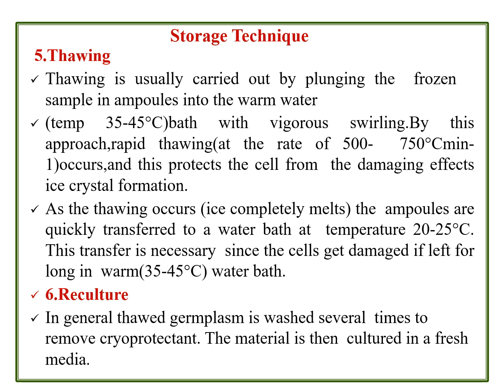As the thawing occurs, the ice completely melts. The ampoules are quickly transferred to a water bath at a temperature of 20 to 25 degrees. This transfer is necessary since the cells get damaged if left for long in the warm bath condition.